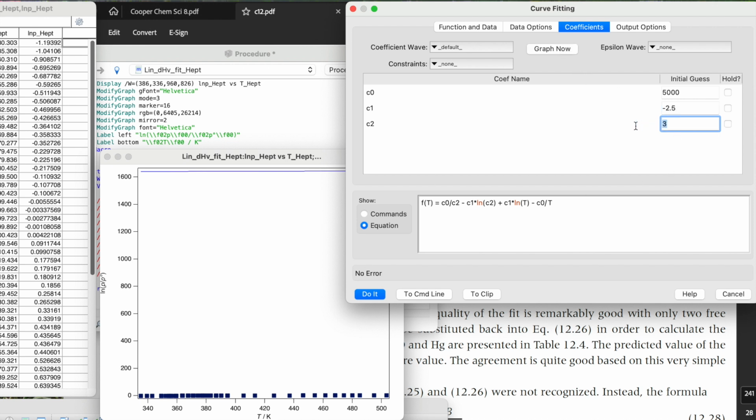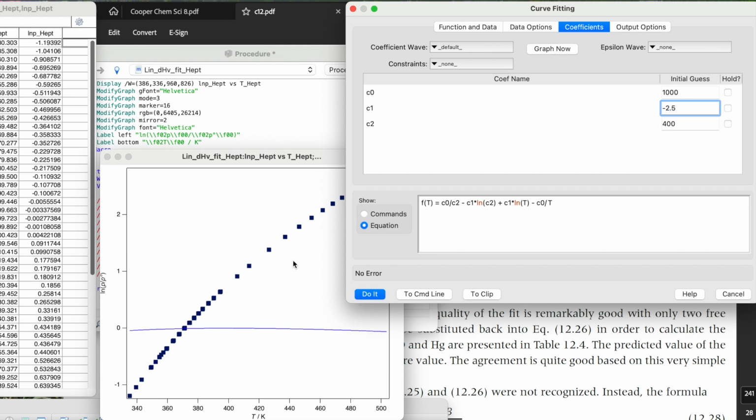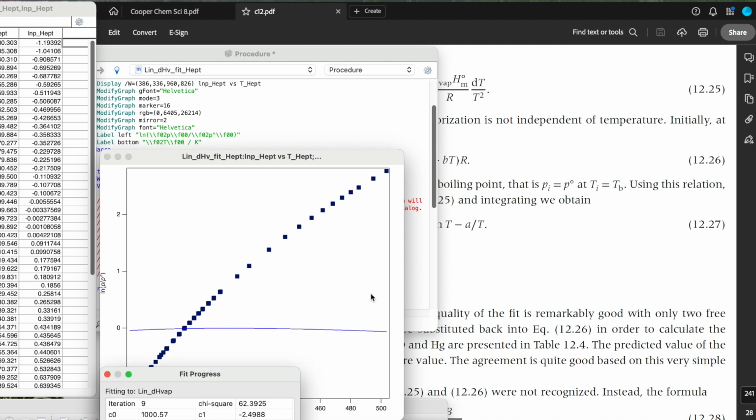We're still way off, aren't we? But now we're heading right in there. You don't have to get very close, but you just want it to be somewhere in the neighborhood, right? If I start this out here a little bit worse off, not looking very good, but at least it crosses the data. And that very often is good enough to get us a starting point. Then we can let her rip.